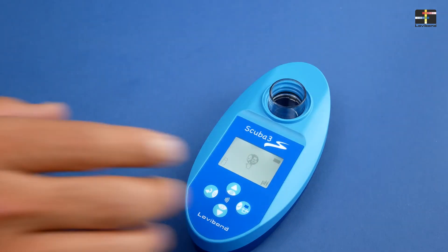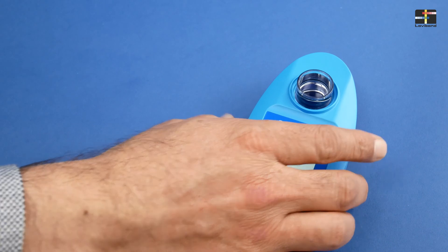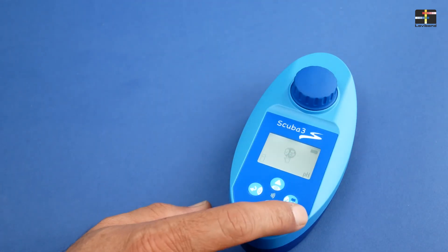Fill the measuring chamber with a sample of your pool water, close the measuring chamber with the cap and press test key to perform zero adjustment.